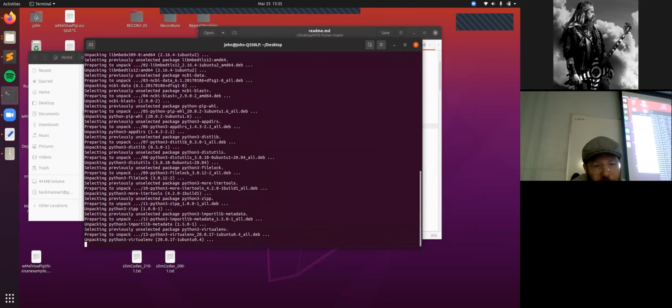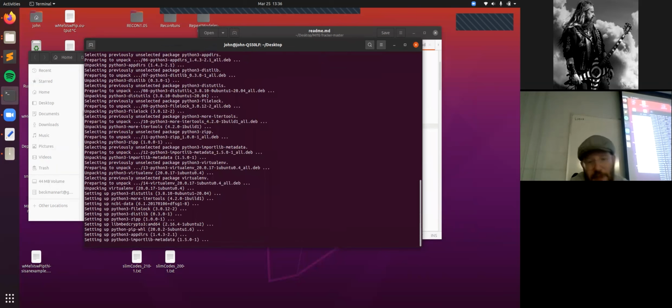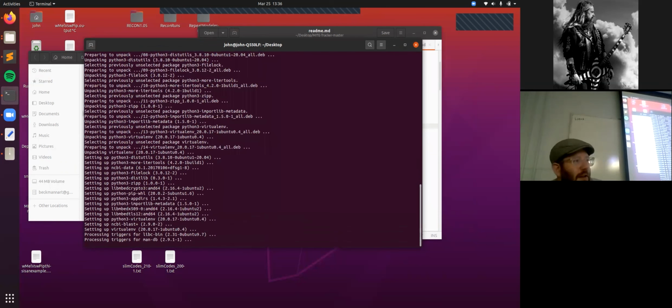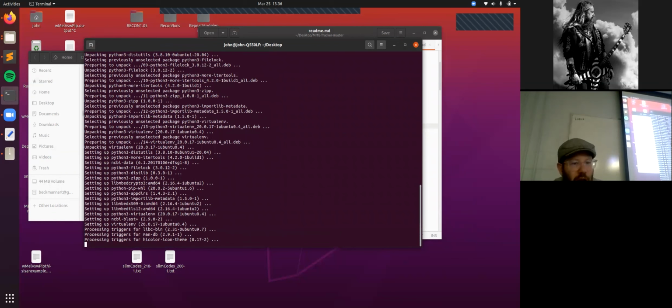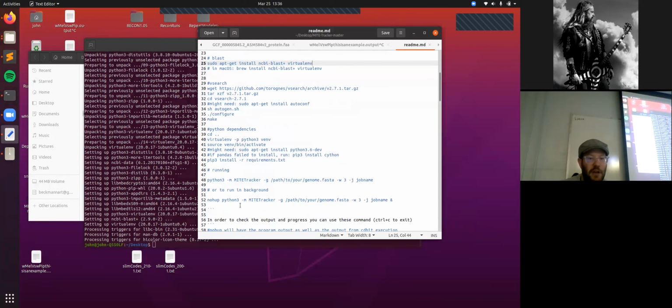I don't know how long this would take. I won't make you guys sit here forever, but you get the point, right? This is how you would approach it. And then once you start trying to run it, I guarantee you, even once you get through the README and you've done all this stuff, you'll try to run it and it'll say it won't work because you don't have this module. And then you have to search how to install that module. Then it won't work because you need the next module. And you just progressively go through until you get closer and closer to actually running the program. And then you can actually run the program at the very end. Does that make sense? Okay.